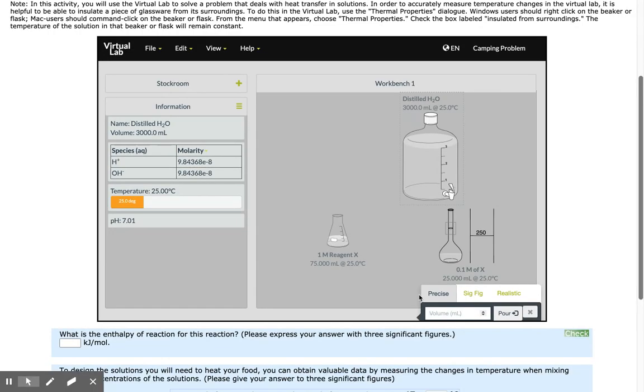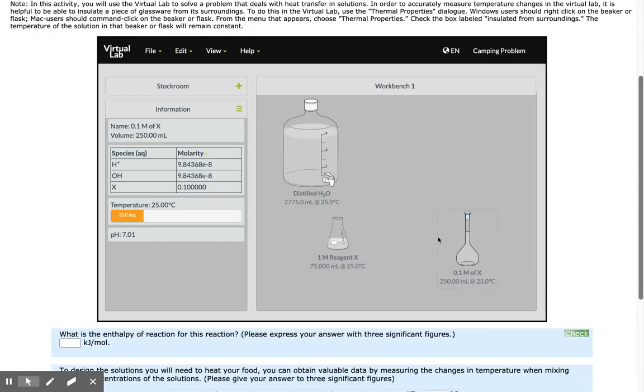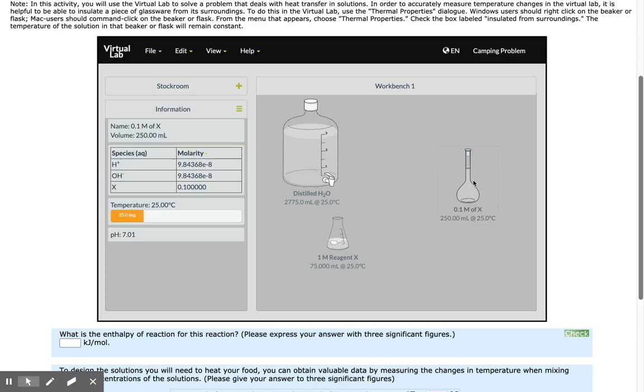250 minus 25 is 225.0. Pour that water, and you can see now that the volume is at 250.